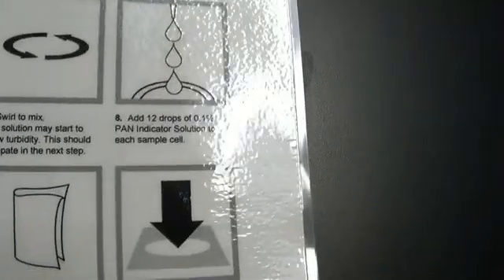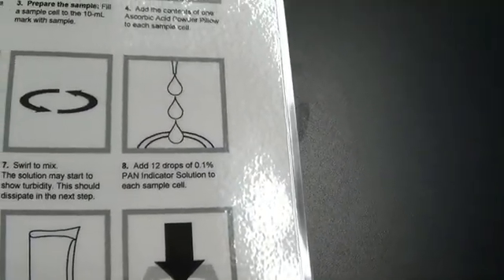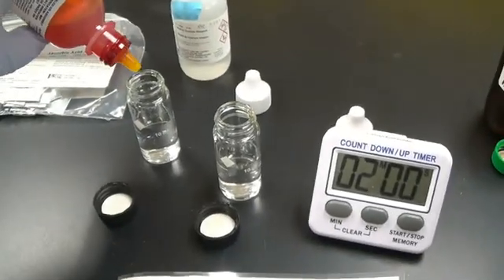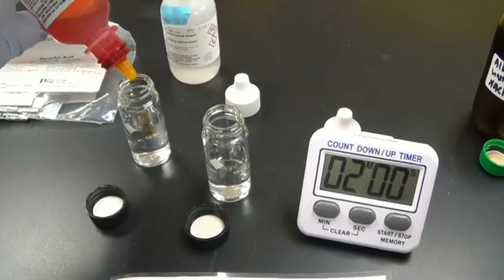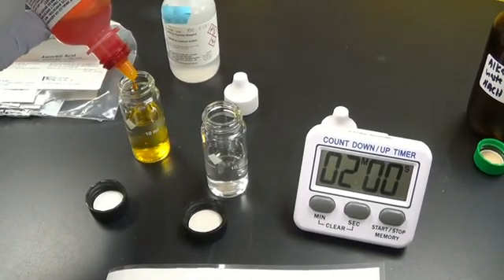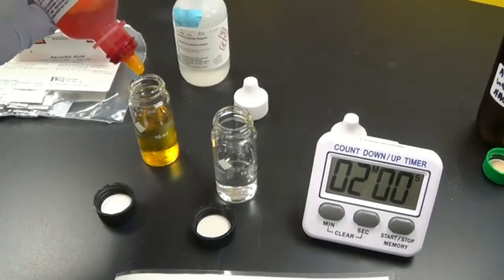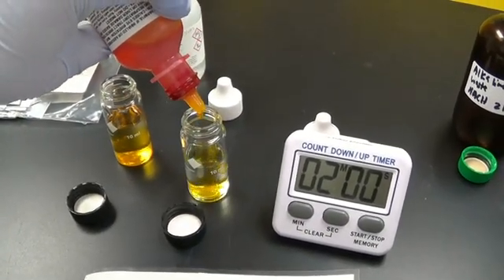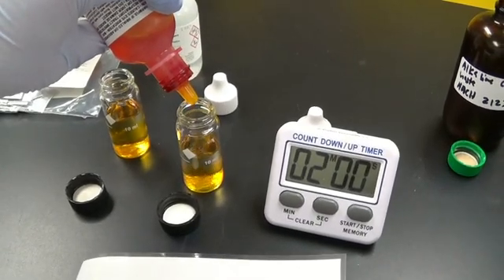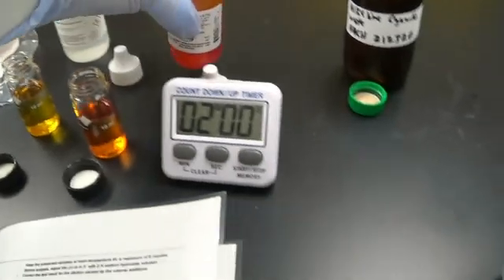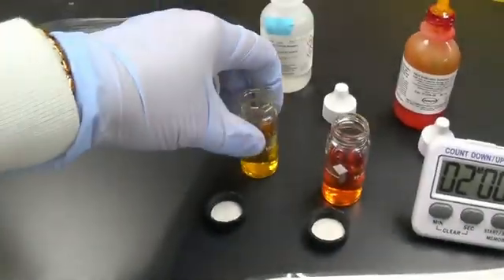Now I add 12 drops of the 0.1 pan indicator solution to each well and swirl.